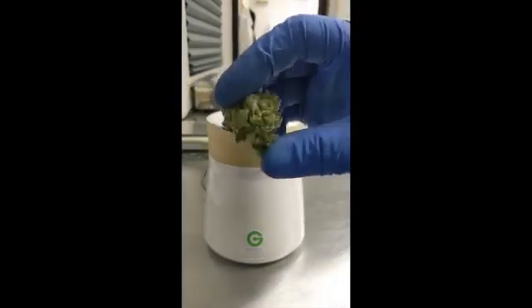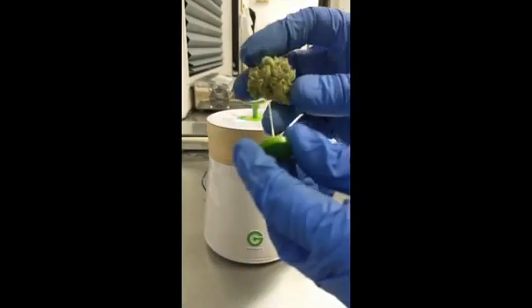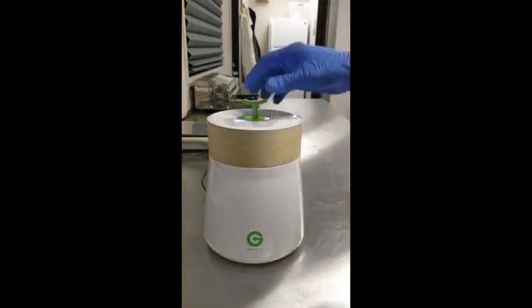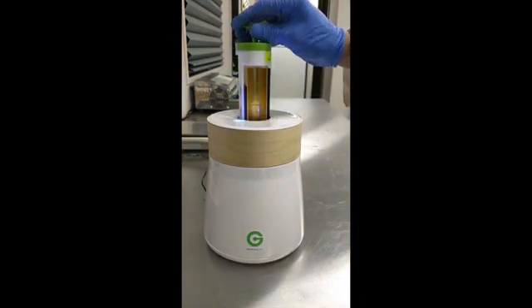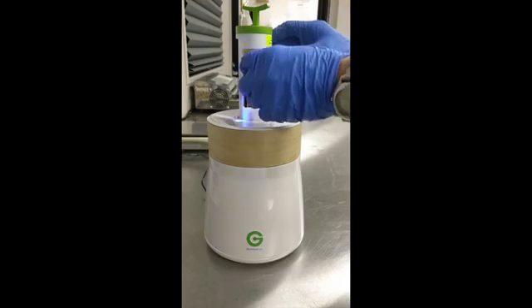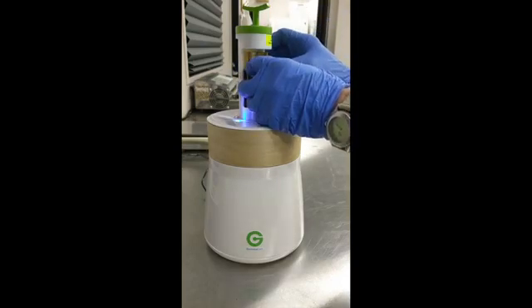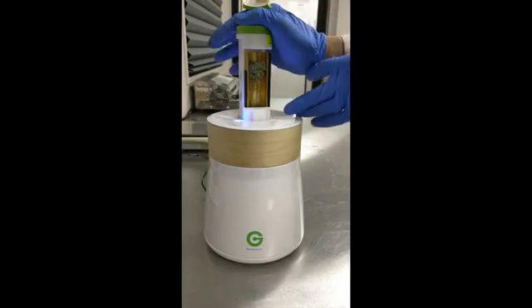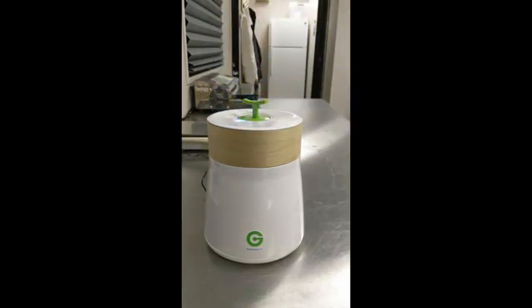You take your flower and insert it on this needle, which is attached to a magnetic device. Then you simply open this little drawer and place the magnet on the little magnetic receptacle, and carefully close the door.